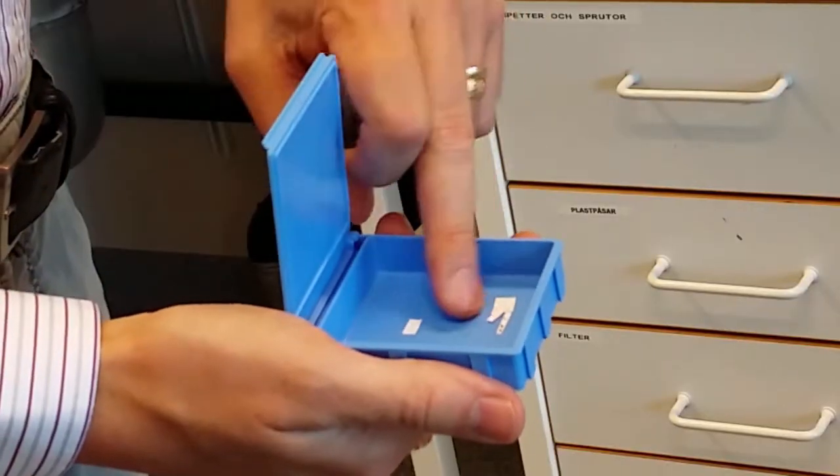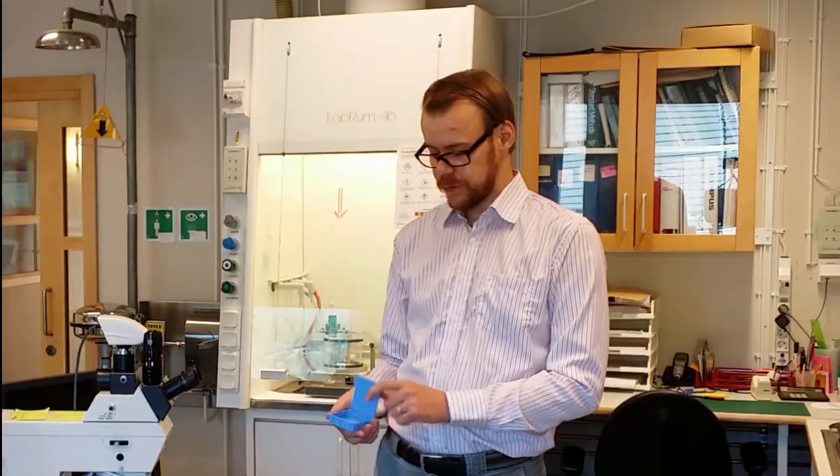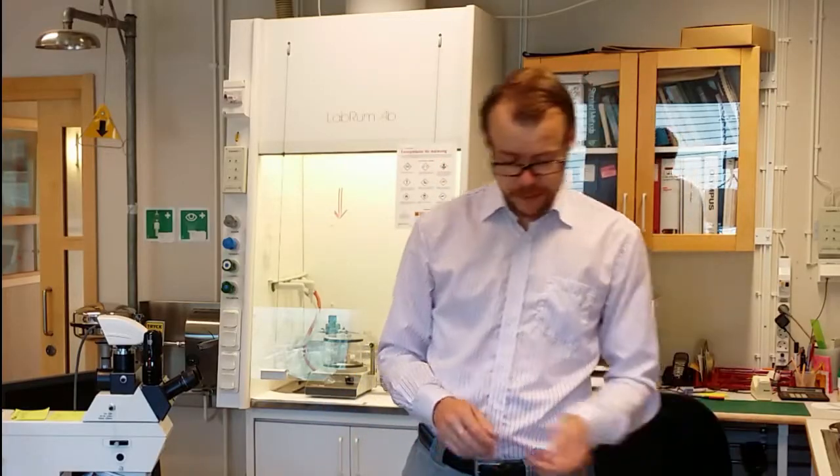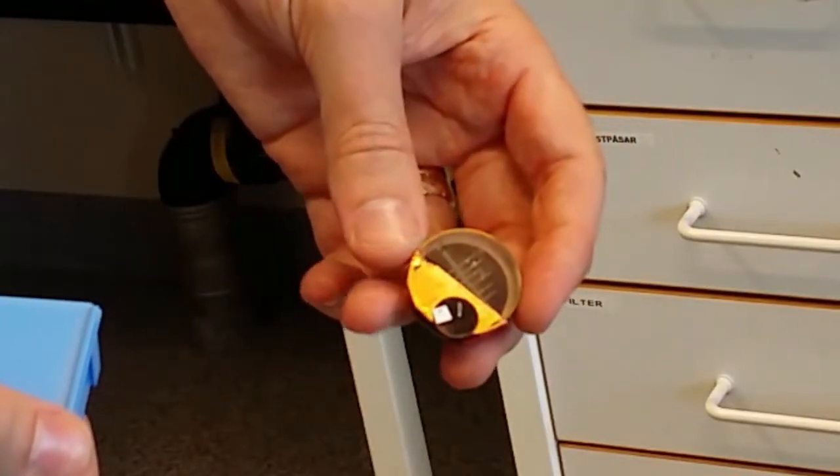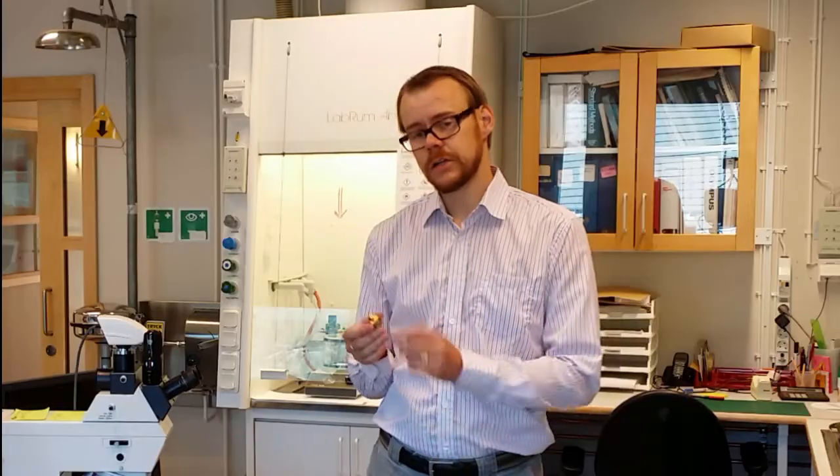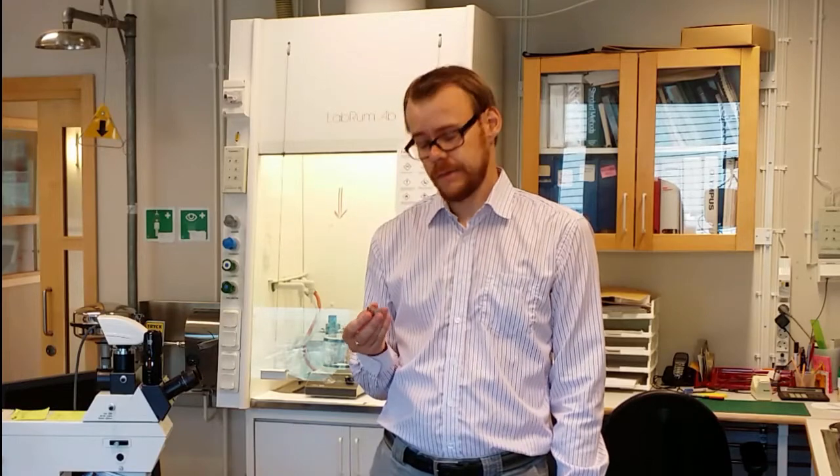Hi, if you have samples, for example paper substrates, that you want to embed in plastic so they become like this, you need to grind and polish the surface before it can be examined. Today I'm going to show you how to make that and how to create this mirror-like surface.